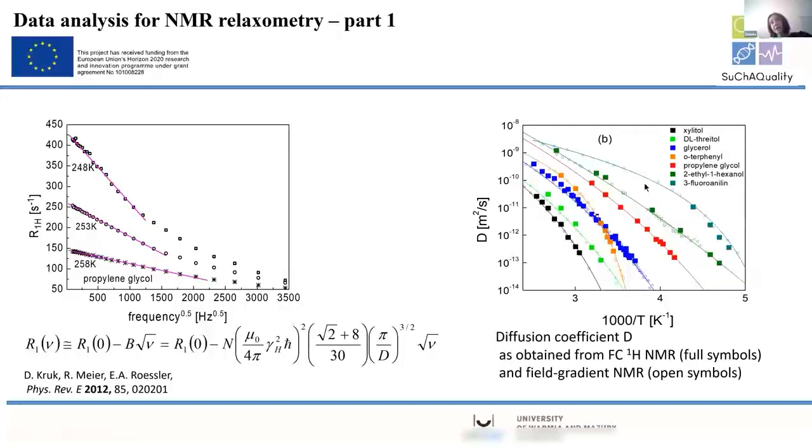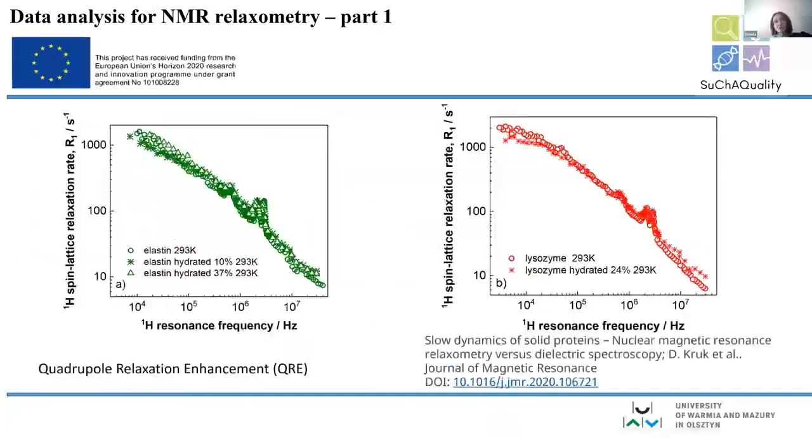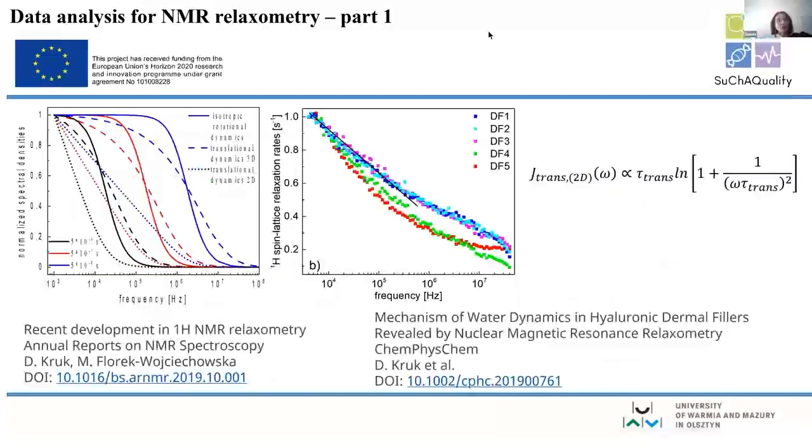But before that, here you see that we tested this concept for very different systems, comparing diffusion coefficients obtained this way with diffusion coefficients measured by gradient NMR methods, and the agreement is very good. Not going into detail, this concept is confirmed. I will show you this thing shortly. And just the last slide, although I have more, I would rather prefer to stop at this moment and give you a kind of exercise, which we solve together because I think we do not have so much time.